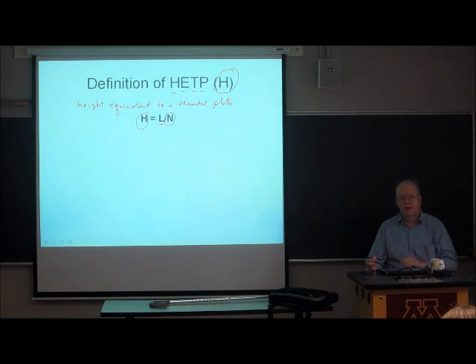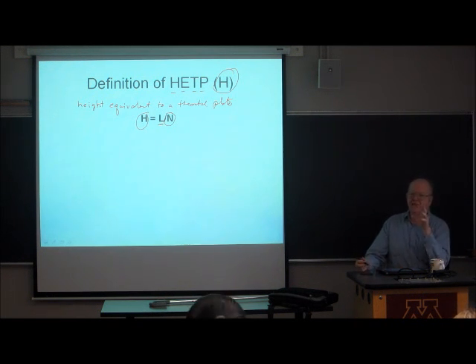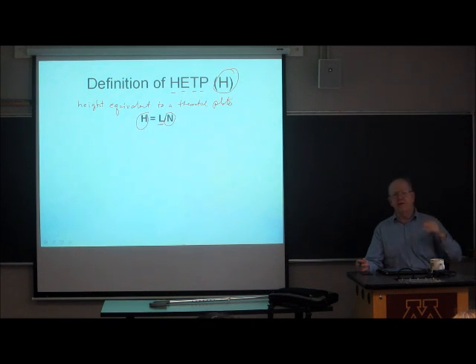Is that ineffective? If I mean ineffective, I will say ineffective. This is N, the number of theoretical plates. And you can assume that I'm talking about the number of theoretical plates unless I specifically say the number of effective plates. Okay, I will not violate that.